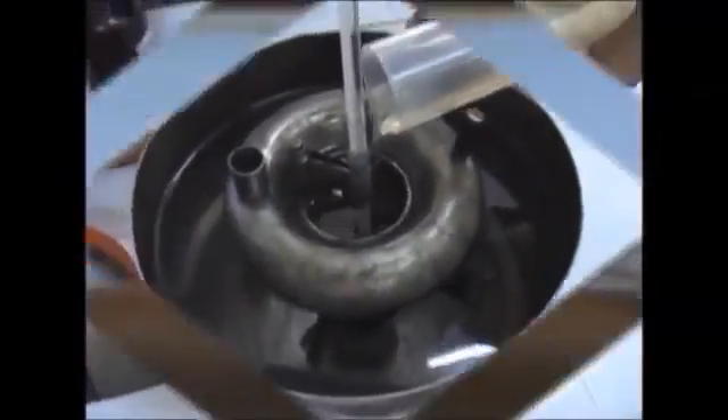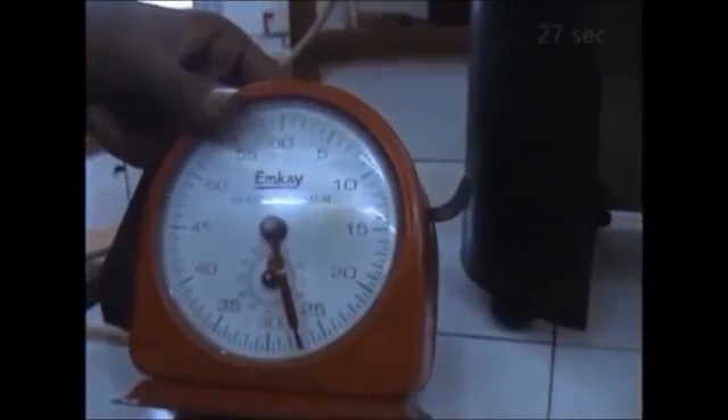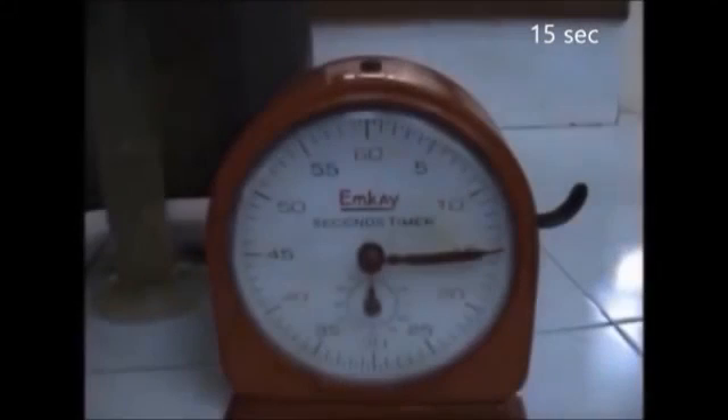Refilling the vessel, we repeat this procedure for 50 degrees. Our second reading comes to be 27 seconds. At 60 degrees, the time taken by 50 ml of lubricant is 15 seconds. Remember, it's important to keep stirring. When the temperature rises to 70 degrees, the stopwatch displays 11 seconds as the time taken.